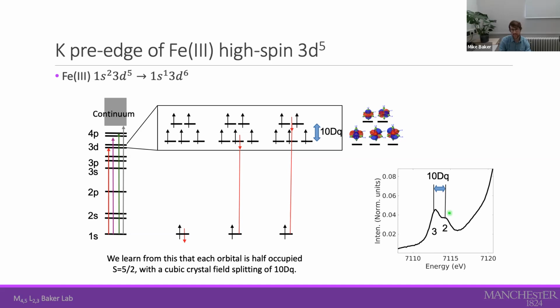Now, importantly here, this shape is directly characteristic to the oxidation state, of course, because the oxidation state is simply the number of electrons in the d shell here for this first row transition metal ion. And also we learned something about bonding, since we were able to deduce this energy, which is the amount the d orbitals are split.